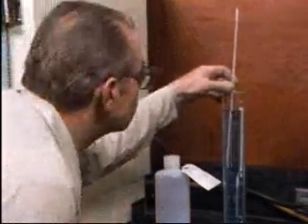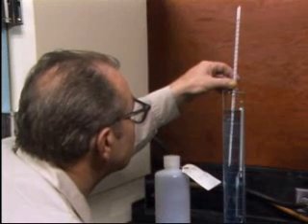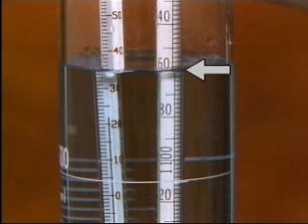The temperature of the sample must be compensated for. The specific gravity of a liquid is related to its density, and the density of a liquid changes as its temperature changes. In this case, the temperature is 22 degrees Celsius. Compensating for temperature means adding a correction factor to or subtracting a correction factor from the indicated specific gravity. Let's look at an example.